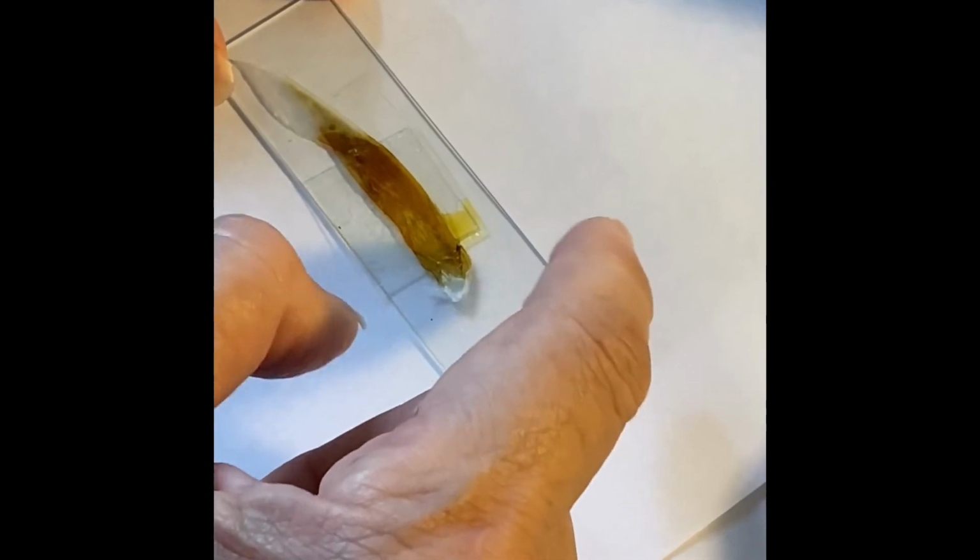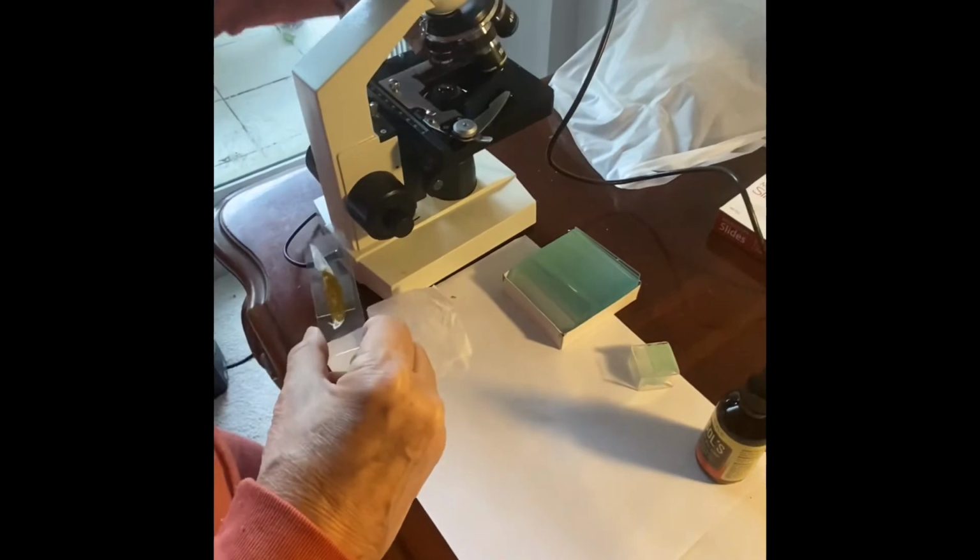Remember, the membrane is not one cell. It contains many cells, so that means that it's multicellular. Many cells. Now you're ready to put it under the microscope.